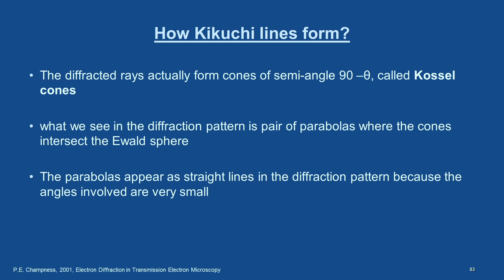You see, in electron microscopy, as we just discussed in the fundamentals, with the increase in the acceleration voltage, your alpha can be reduced or controlled to a very small value, and because of that you can see this.